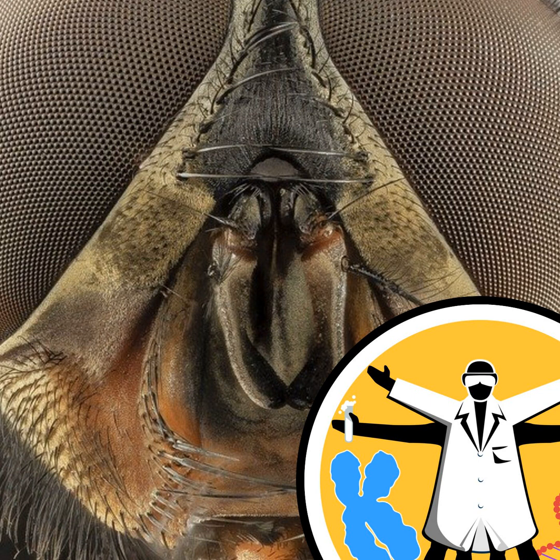And you want to do it with enough stringency so you don't call too many false positives, weird things like bald eagle and minke whale, but without losing too much data. So I think this is a reflection of how far down we've got down the list before we get to something weird. Right. Good sequencing job.